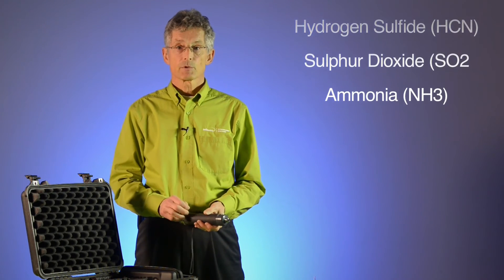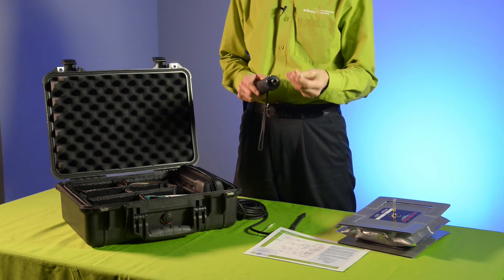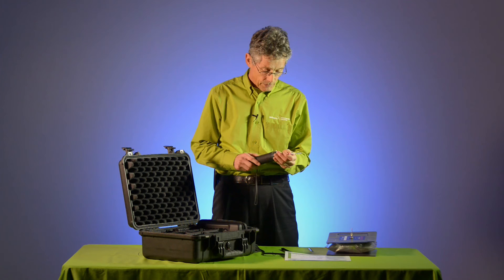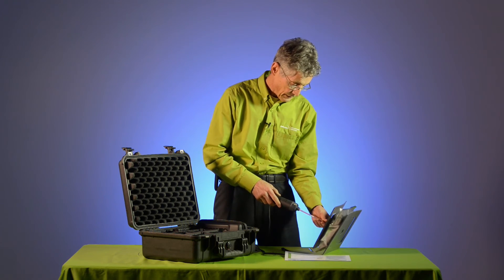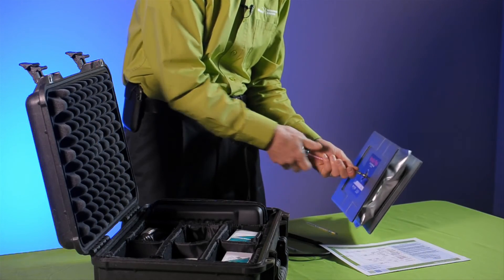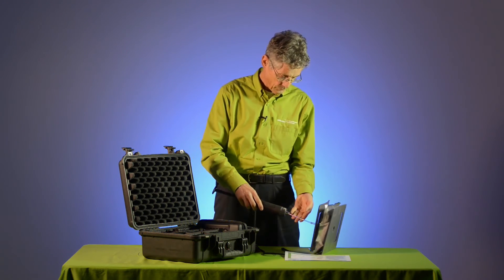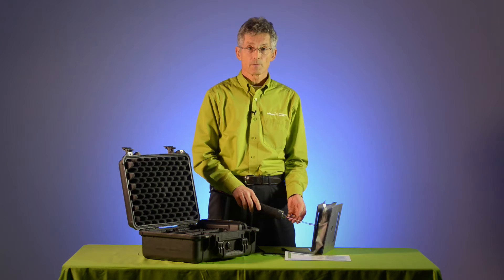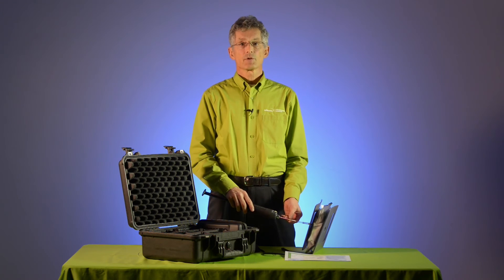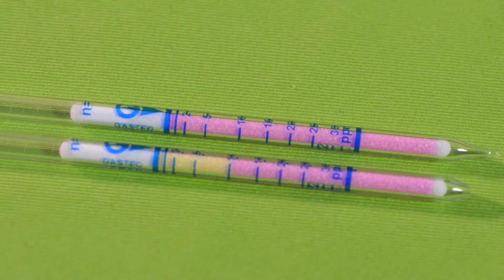In order to differentiate between the three possibilities, we begin with the 3L ammonia tube. We insert the tube and begin to see the coloration of the tube caused by the ammonia in the sampling bag. At this point, we have identified the presence of ammonia and we have quantified that the concentration is around 10 parts per million.